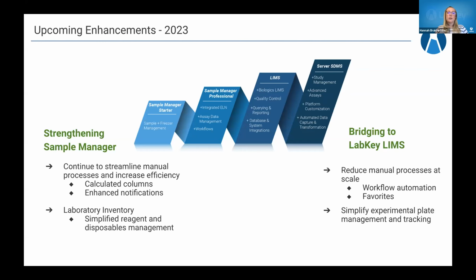We also have a lot of folks that are managing their laboratory inventory currently within Sample Manager. We want to extend that use and enhance it a little bit, creating a more simplified reagent and disposables management system. And then, of course, continuing up this path.